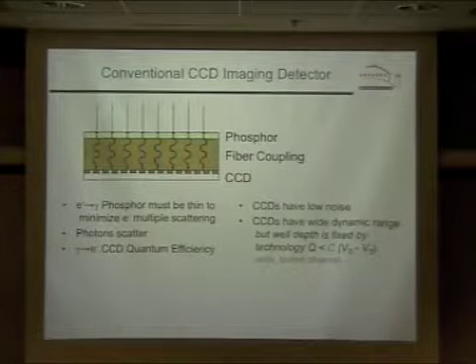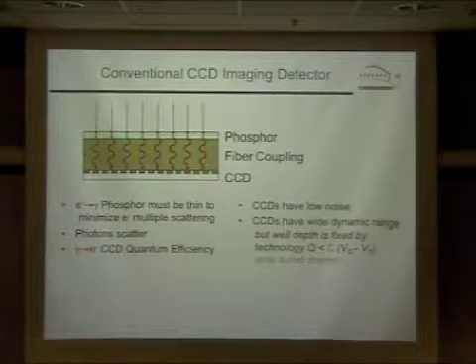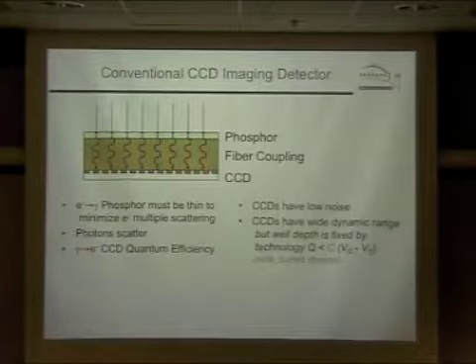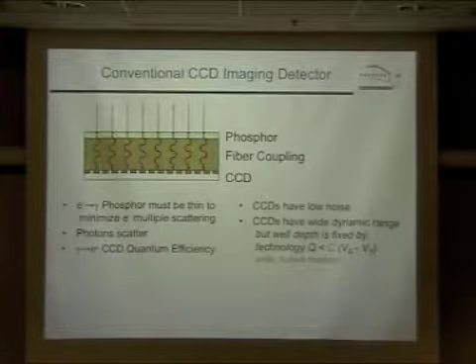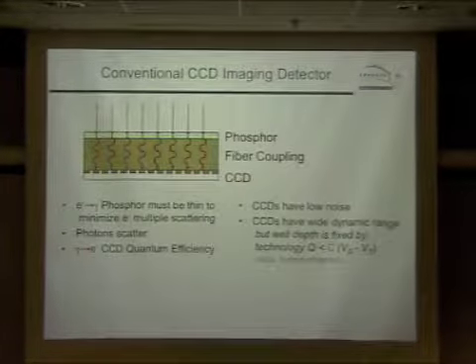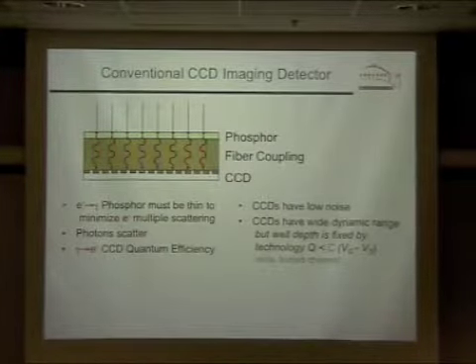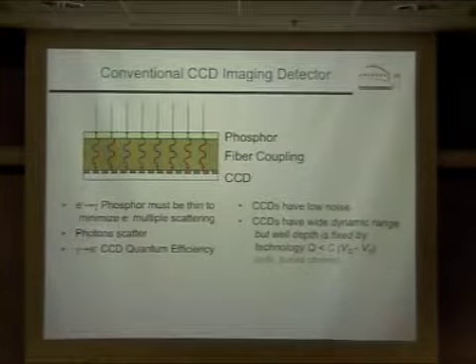They also have a very wide dynamic range. I don't know what we would say the dynamic range is for film. It's something like a factor of 10 or maybe 100 if you do some corrections. But typically it's a factor of, say, 10 to the 4th for a CCD. That's not enough to cover the whole range of intensities that you find in an electron diffraction pattern, especially if you include the unscattered beam and the area around it, but it's vastly better than with film.